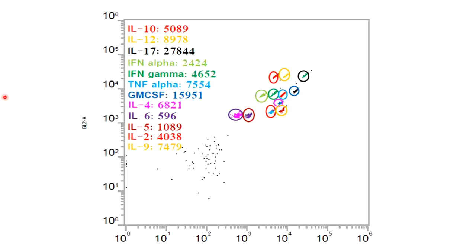Now we are not talking about the cells, we are talking about the proteins. Can we measure the proteins by flow cytometry in a given serum or liquid where cells are absent? Yes, but people will do ELISA. Then I ask the same person, can you measure both interferon gamma and TNF alpha for me? The person will say yes.